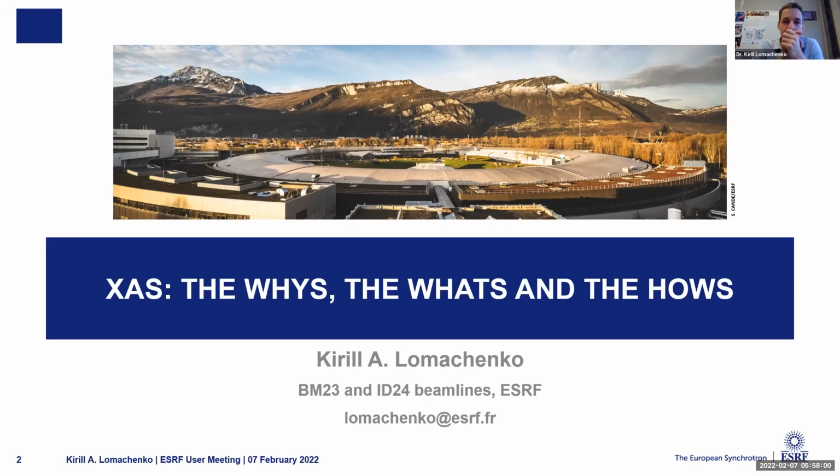Well, first of all, you will not measure EXAFS of lithium. It is not possible because it's just too light, the energy is too low. You can have some chance of seeing lithium as a neighbor of something else, if you have heavier metals or heavier elements in your electrolyte. But I'm not sure whether you can see lithium ion flowing, because the problem with lithium, again, even as a neighbor, is that it is very light, so its scattering amplitude is very low. It's very difficult to see lithium.